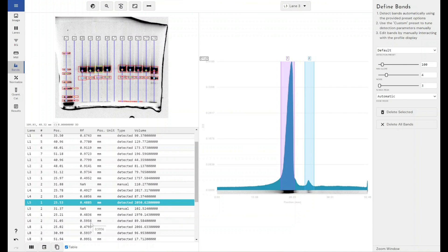And that's it in a nutshell, essentially. RF is a ratio. It is how far has my band traveled out of a theoretical maximum, out of the entire lane that it could have traveled.